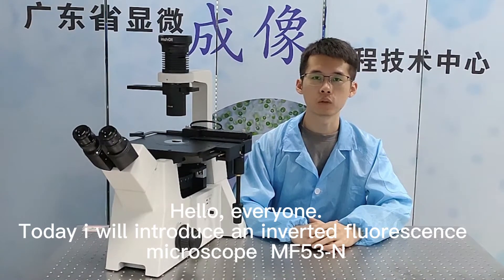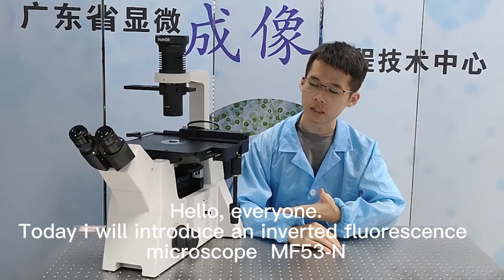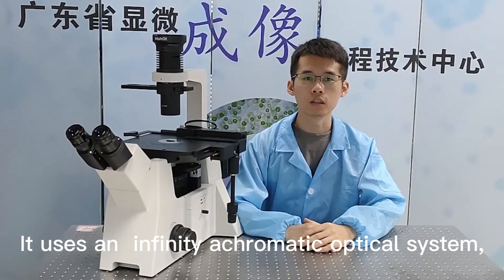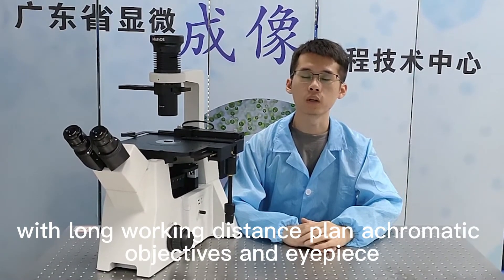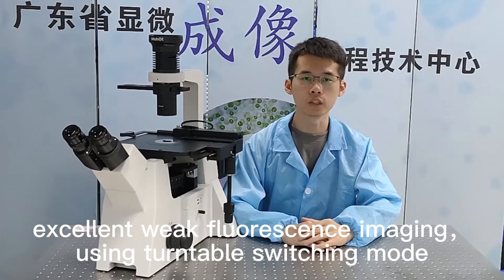Hello everyone, today I will introduce an inverted fluorescence microscope MF53N. It uses an infinity achromatical optical system with long working distance plan achromatical objectives and eyepiece, providing excellent weak fluorescence imaging using turntable switching mode.